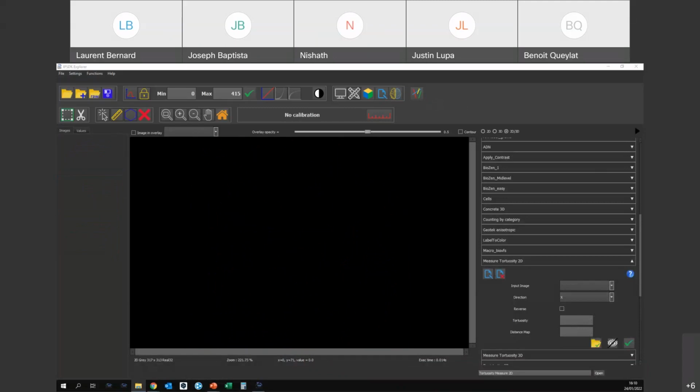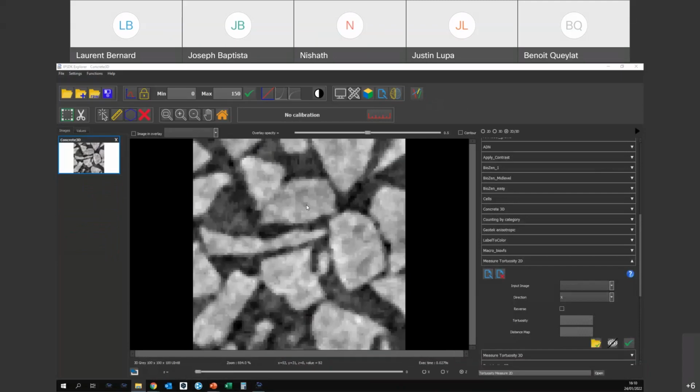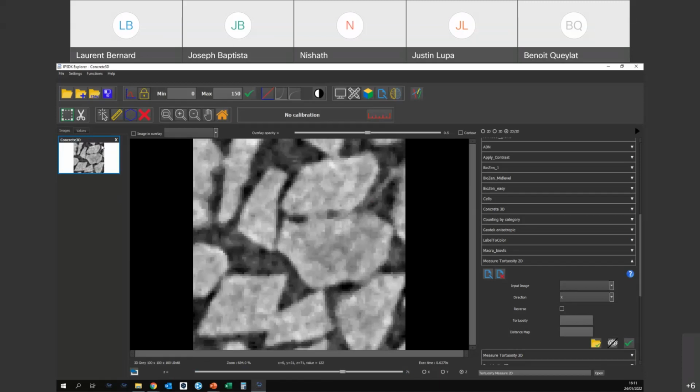So first of all, let's say it's not a bug fix, it's more like an enhancement, graphical and ergonomic enhancement. This is a 3D data set. And previously, when you wanted to make a crop, we were just cropping half of the Z slices, half of the data set, and not cropping all along the full 3D volume. Well, it was done for many reasons, to minimize memory, just to go on region of interest, but most of you dealing with 3D datasets were requesting to be able to make an extraction along the full dataset.